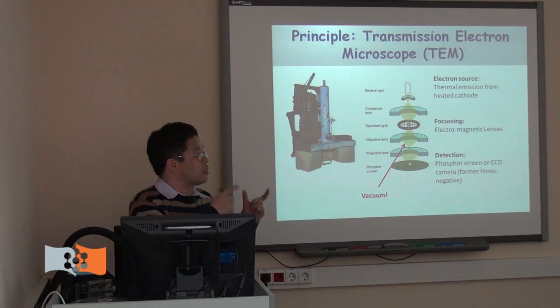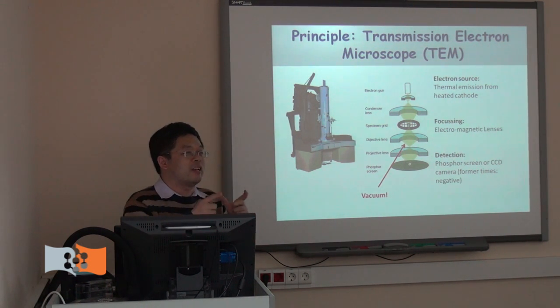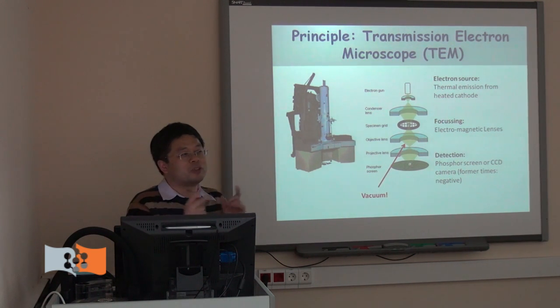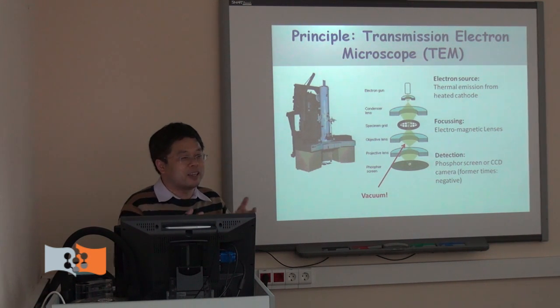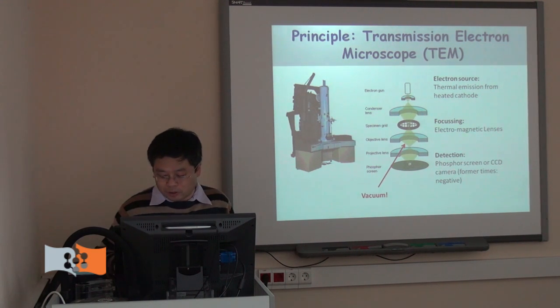Using cryo-EM, not in my lab but in this field, people solved an ion channel at 3 angstrom resolution. That's a real breakthrough. We don't need to crystallize the membrane protein, and we can see it very clearly. This was published 2 weeks ago in Nature, in 2 articles.